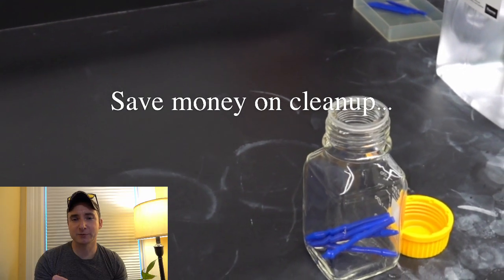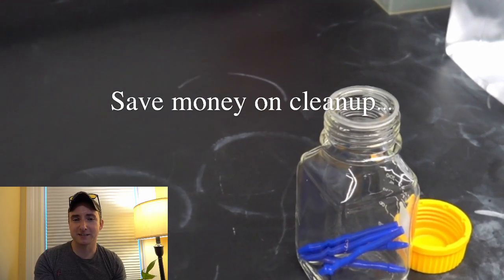Take the pestle out of the drill when we finish a sample. We plunk it in a flask or a beaker, put in a little bit of 20% bleach for 20 minutes, and after that we use some really good Milli-Q water to give it a really good rinse. You don't want any residue bleach getting into your next extraction. Then lay them out on a paper towel underneath a UV light in a PCR hood or a biosafety cabinet just to dry.